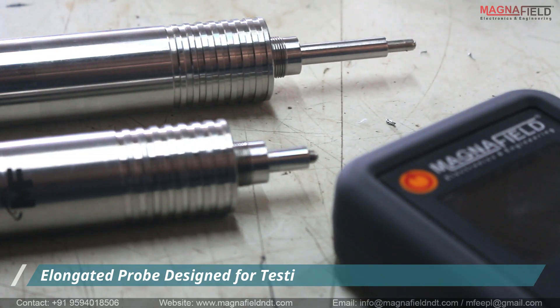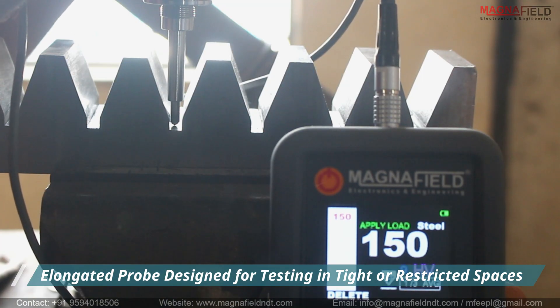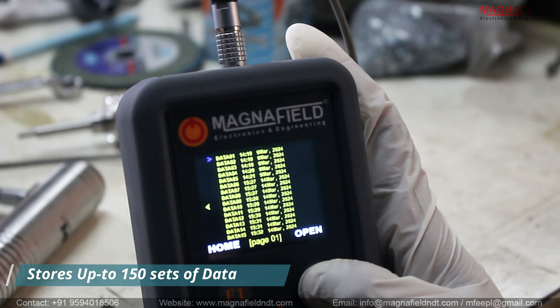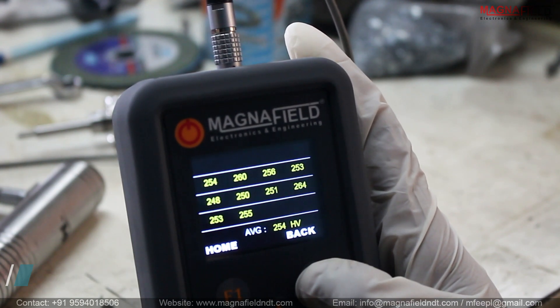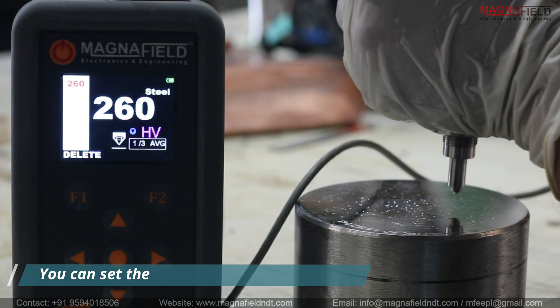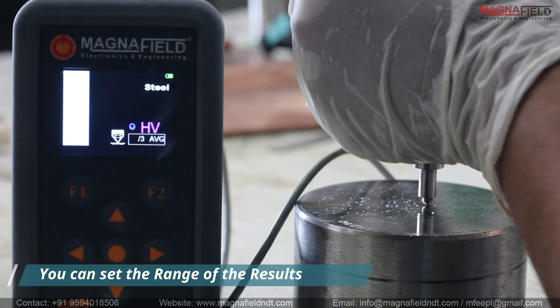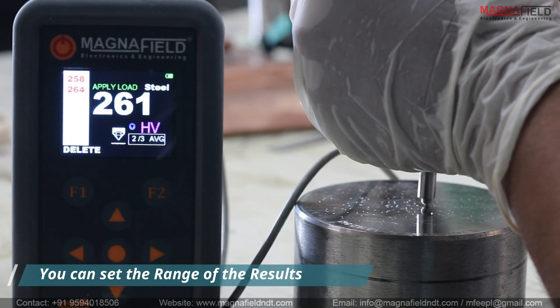We also offer elongated probes designed for testing in tight or restricted spaces. The HU10 can store up to 150 sets of data, accessible through the archive option. It also has a range setting feature — when results fall within the acceptable range, a green box will appear. Conversely, if the results are outside the acceptable range, a red box will appear.